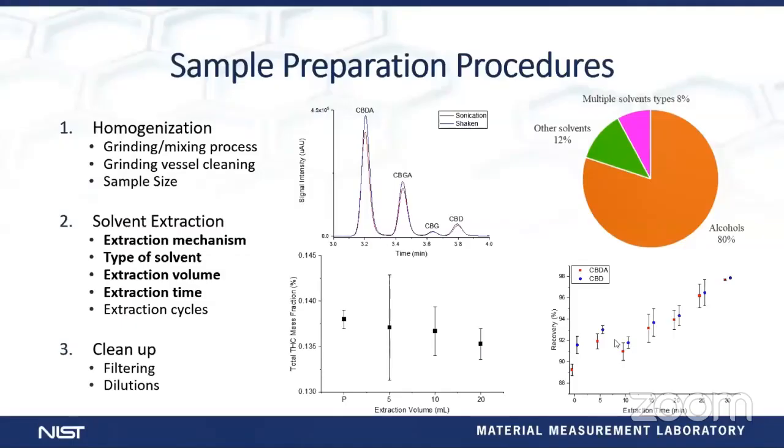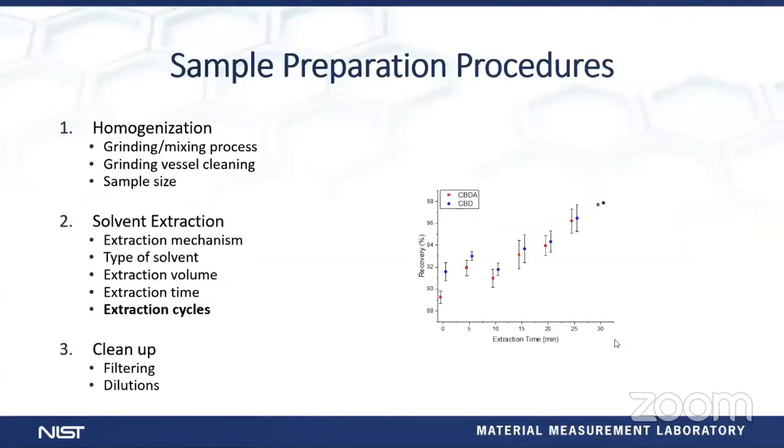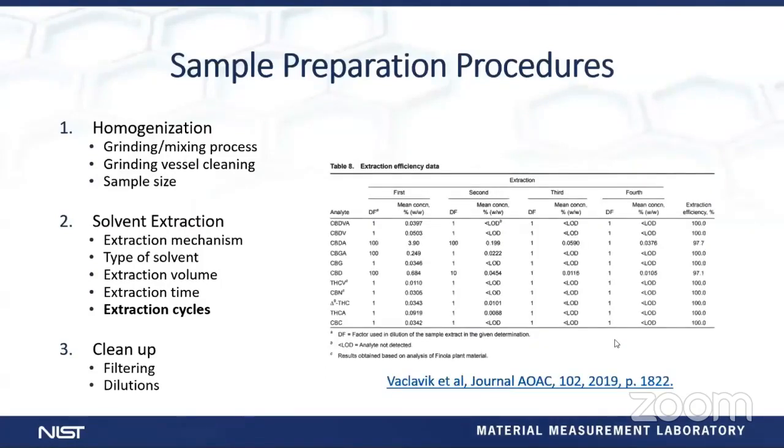But we also didn't want to just do one extraction, we wanted to do multiple extractions. So we looked at the extraction cycles for the process. Here again, you can see the figure I was just showing you. The original method that we based a lot of this from did an extraction efficiency study on the number of cycles that they did the extraction.